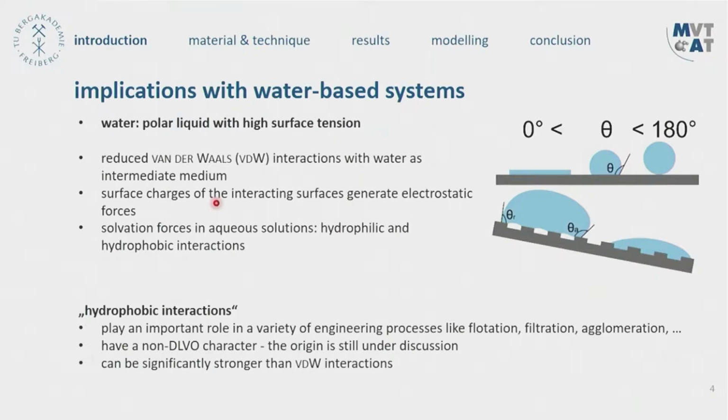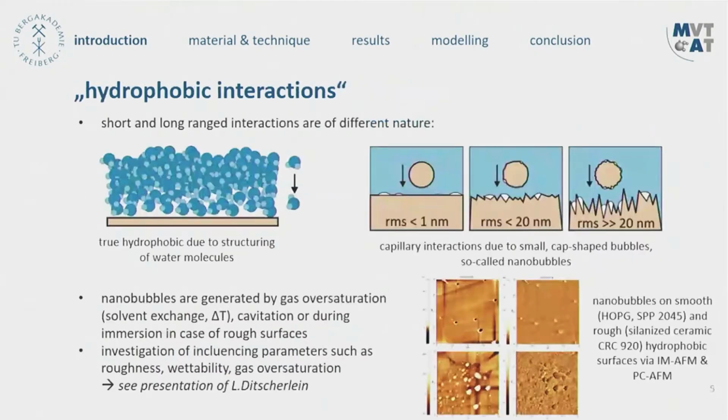But going to the metal melts that we are heading towards, we get wetting angles which are much above 90 degrees. These are poorly wetted systems, so we also have a look at hydrophobic interactions. They are not really investigated, neither in science nor in engineering, not fully understood, and they can be described by some bottom-up approaches, but they are not integrated, not totally quantified. So we go a little bit into those hydrophobic interactions. There are at the moment two explanations in discussion. One thing I think is quite clear.